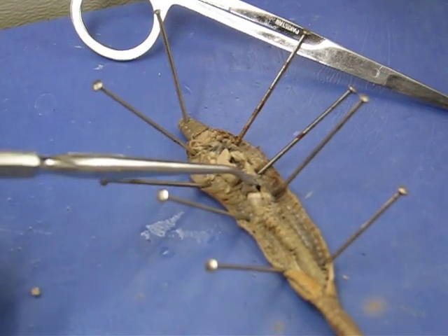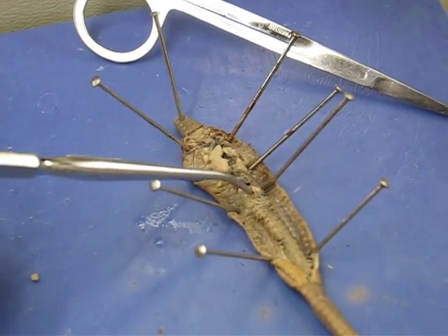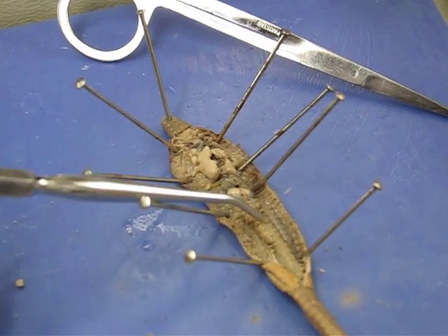When you open it up you see dirt inside. The crop then goes to the gizzard, which is this hard part here, and then that continues down into the intestines.